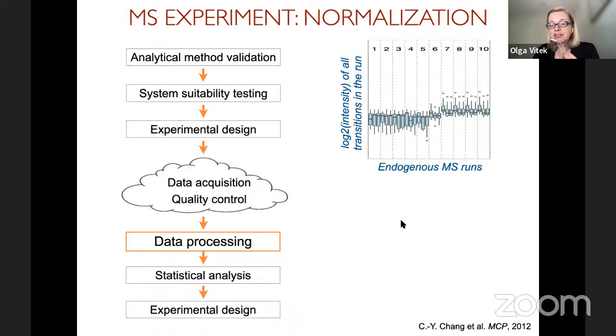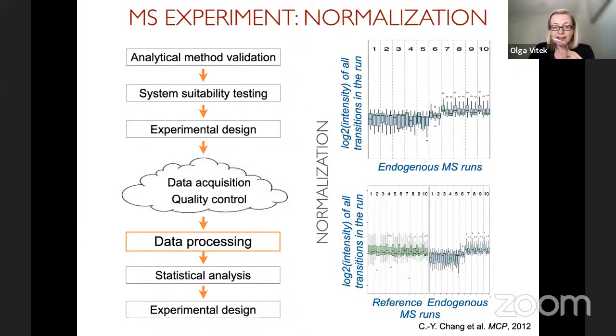And so the question is, is this biology or is this technology? And the answer is, it can be either, right? It depends on the experiment. So the plot by itself only tells us that the intensity goes up, but we don't necessarily know why. Now, this particular experiment happens to have labeled reference standards. So now I can tell you a little bit more.